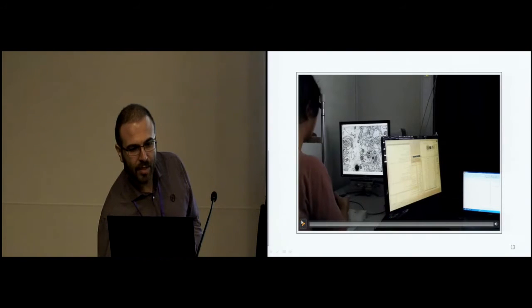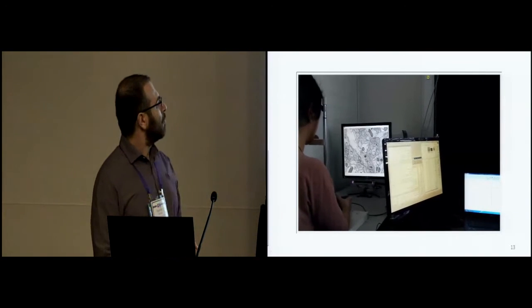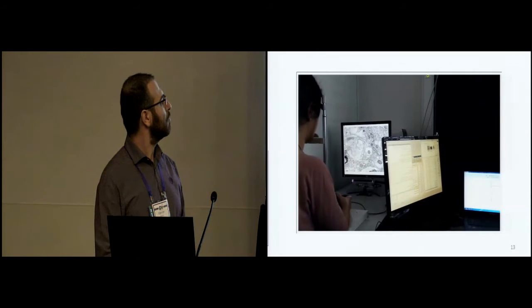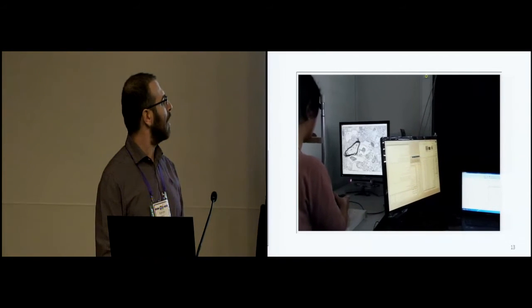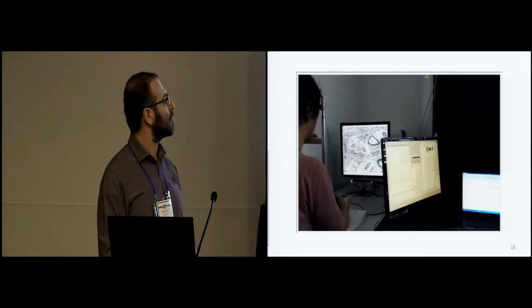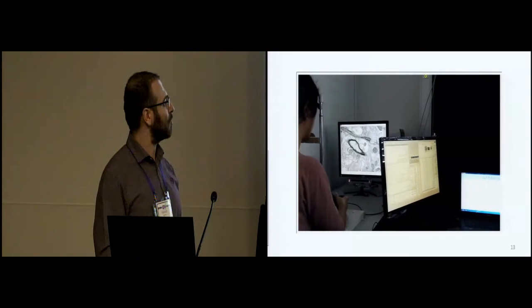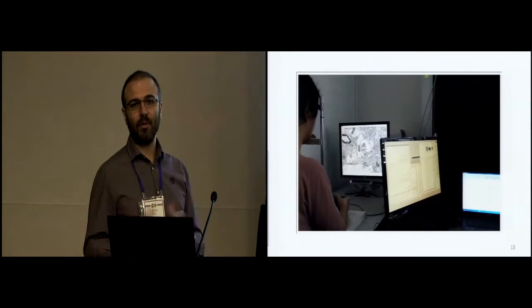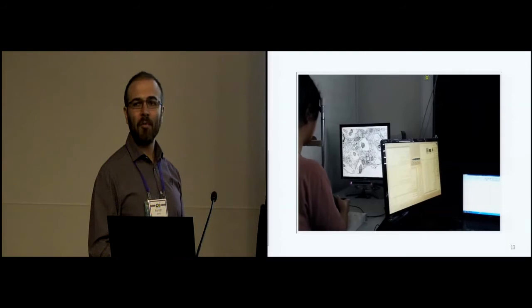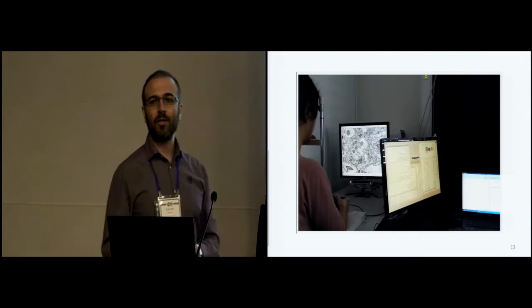Here you see our system in action. We had to use a chin rest, as you might have noticed, because the accuracy of the eye tracker was not as high as we wanted, but it was a low-budget solution, so for gamification purposes, it was potentially ideal.